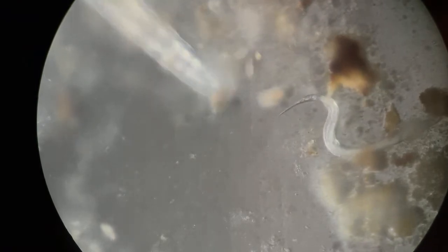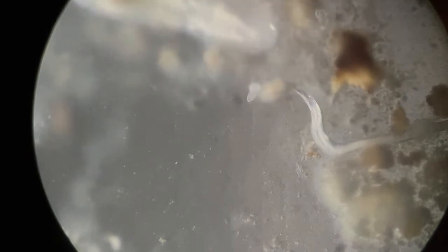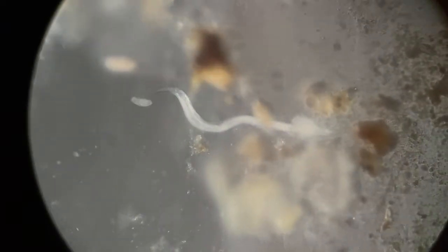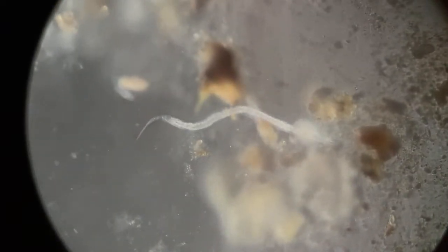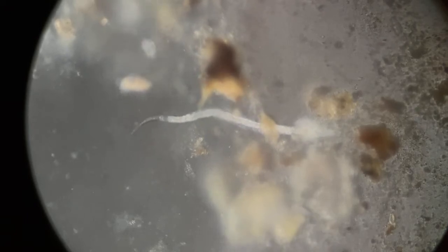There's a new worm next to it, a smaller worm. Just imagine this sheer difference in size. This is for sure a pinworm, a nematode. The same architectural plan is magnified many folds to form this one.